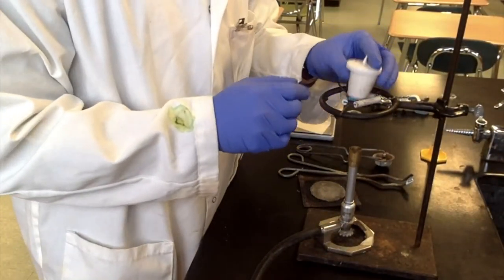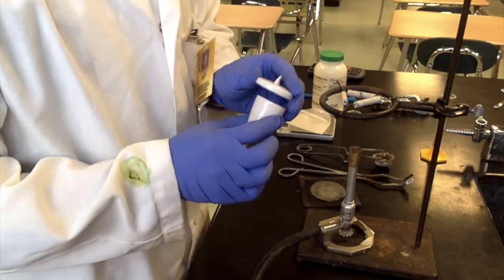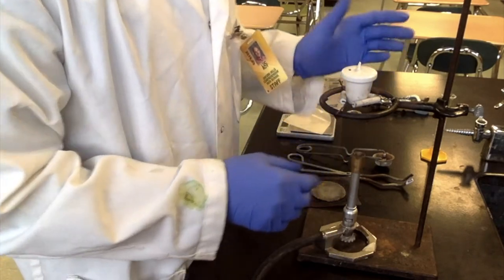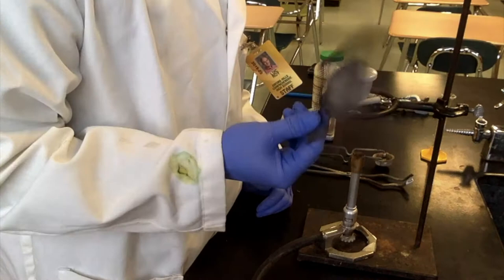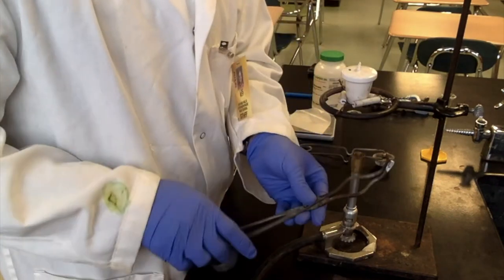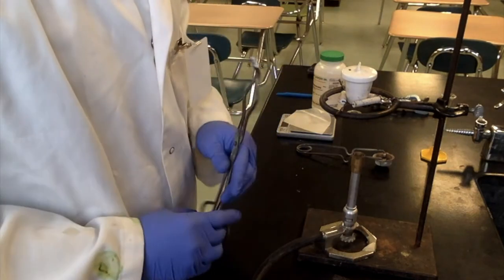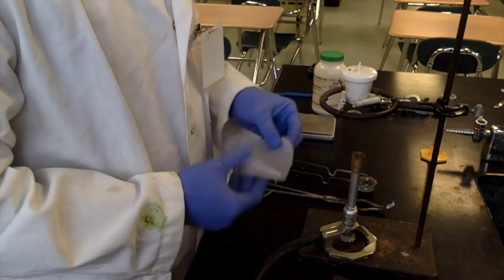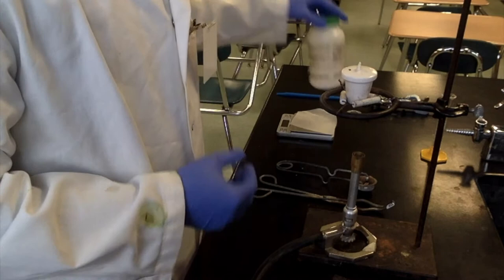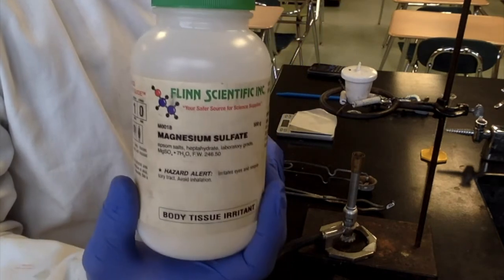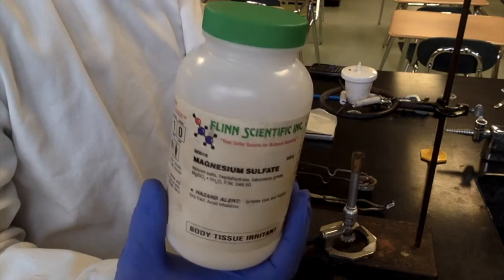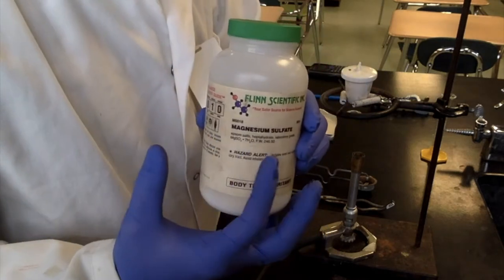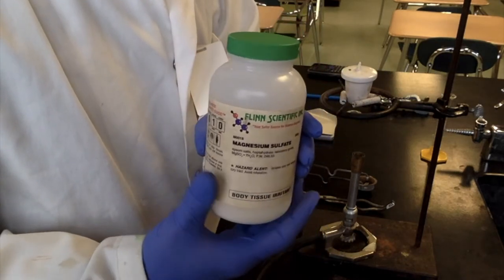All right, so we have a crucible and cover. We're going to clean that in just a second. We have a Bunsen burner, ring stand, clay triangle. To cool it we have our wire mesh. We have crucible tongs specifically for moving the crucible around safely. Sparker, balance with a piece of weighing paper, and the magnesium sulfate which is the hydrated compound that we'll be measuring the amount of water in. You could cheat by just reading the label, but we'll see how close we get to the actual amount.